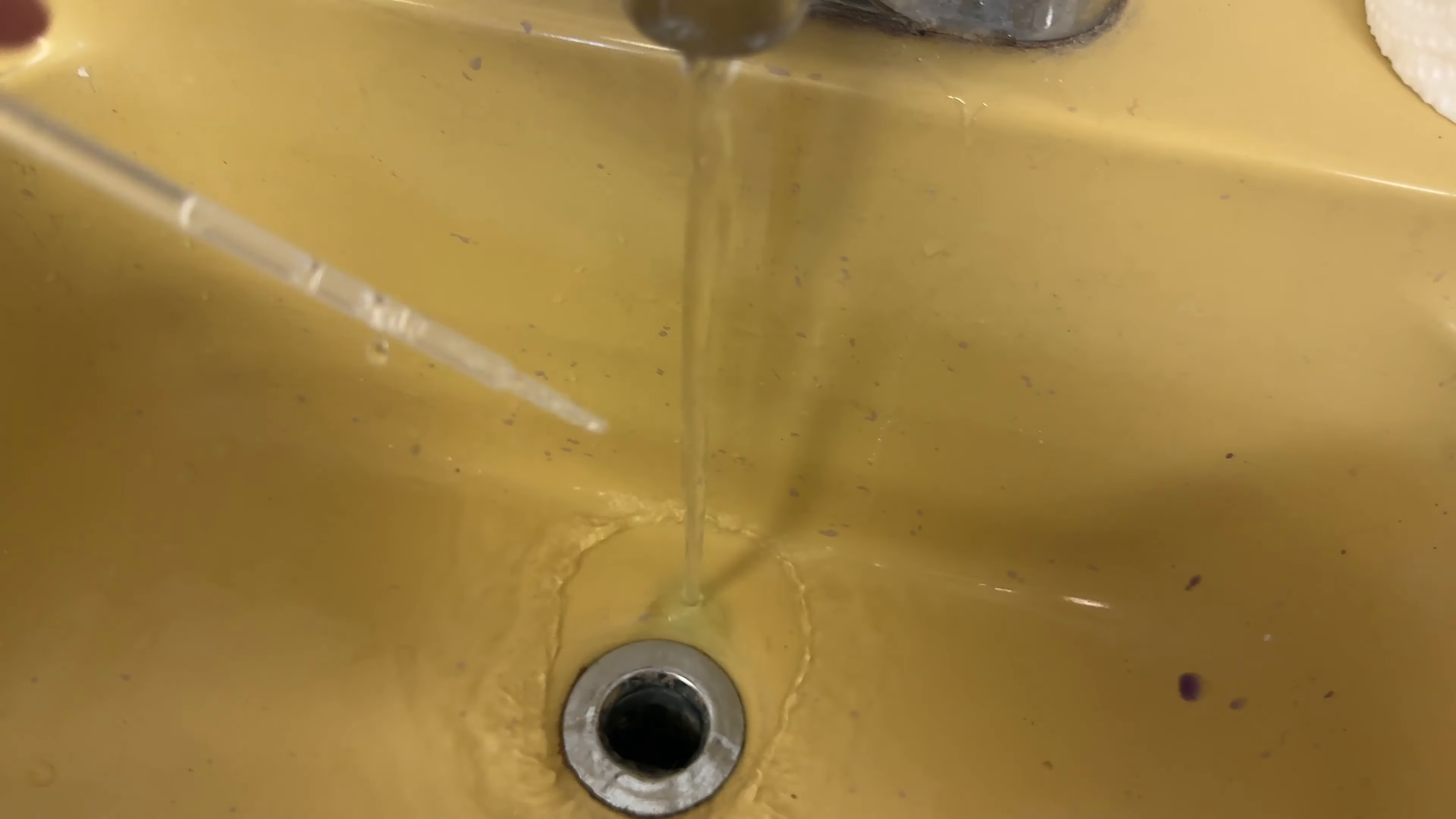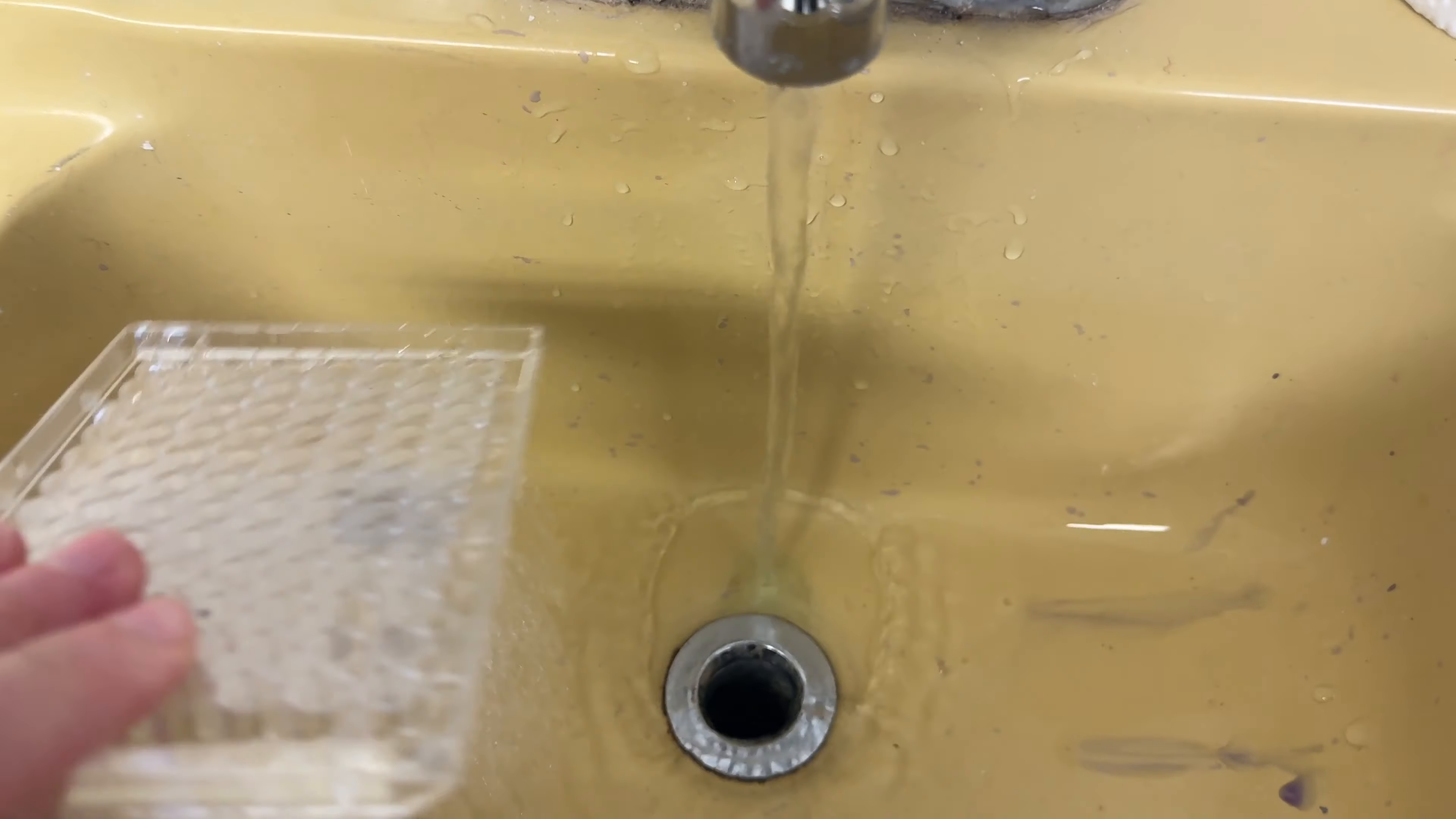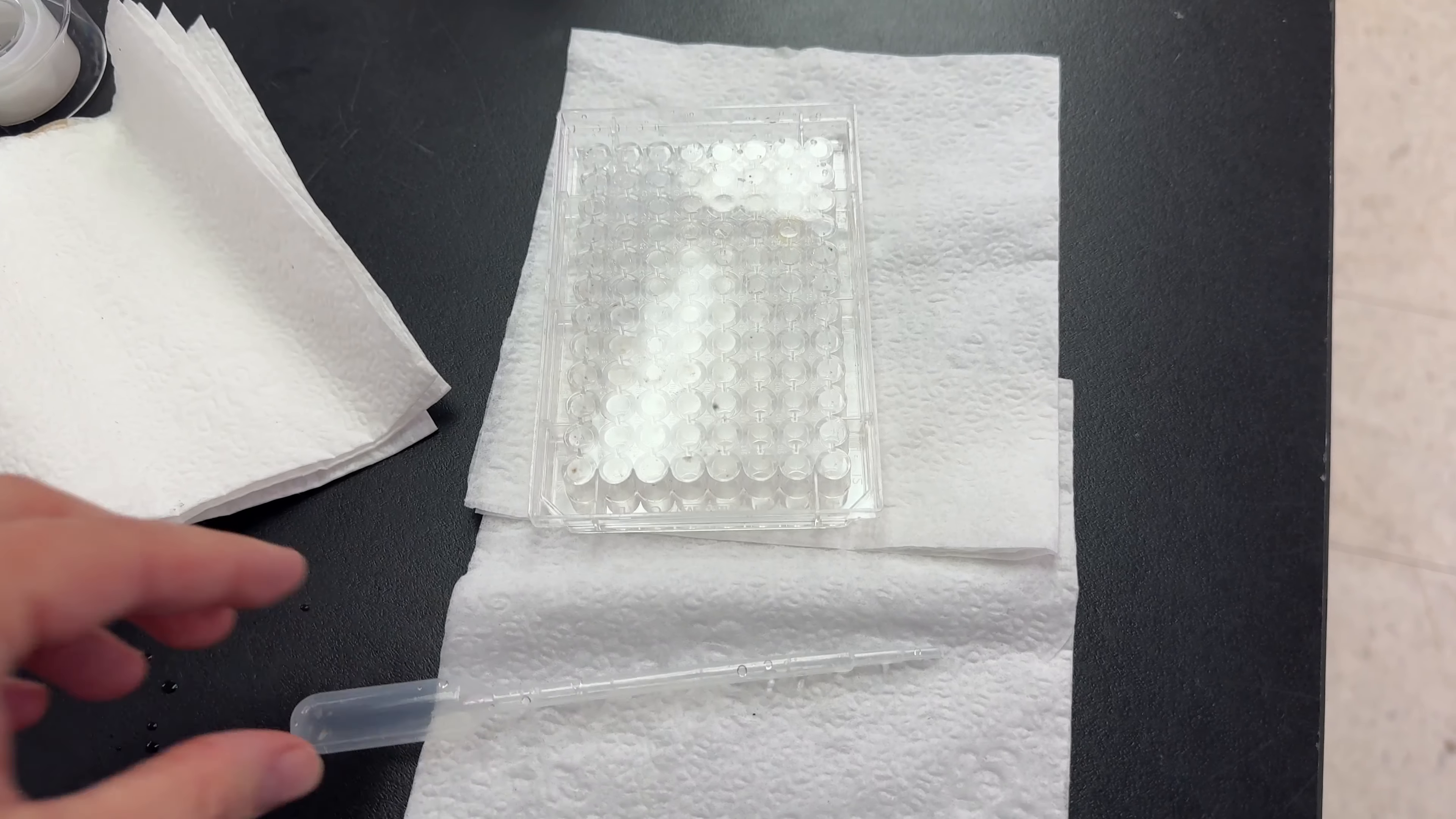After the lab is over, be sure to clean up all your materials and rinse out your pipette. For your reaction plate, when you are rinsing it out, be sure to turn it upside down and swiftly shake out the extra water. When you're all finished, be sure to turn everything upside down on a paper towel to dry.